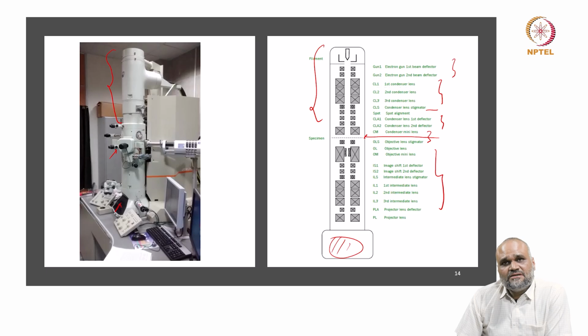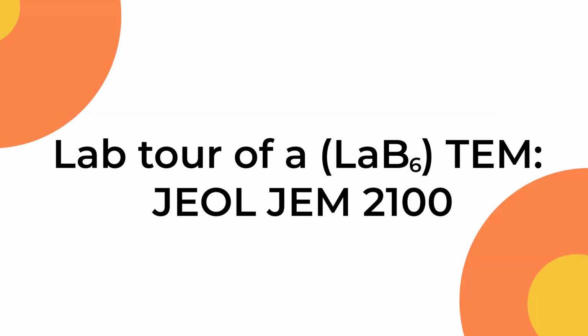And it is important to know, no matter which system you are looking at, how this particular layout is and where these control systems are, because in case you run into any kind of trouble, at least to understand the first level of troubleshooting, it is always good to know which component is where and how it is functioning.